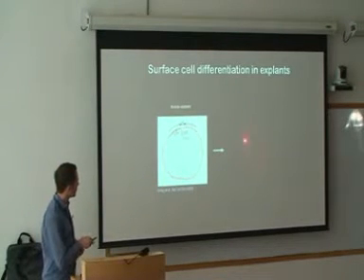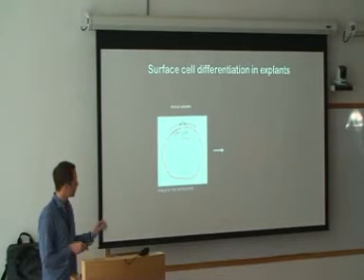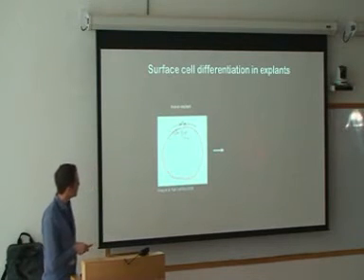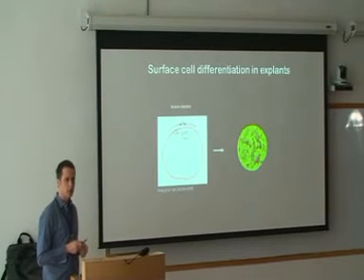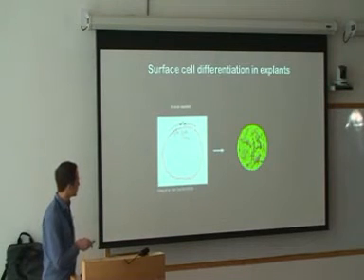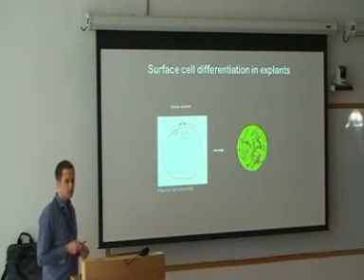What we observed was that once we took a tissue, in this case an ectoderm cluster of cells, from an embryo which is expressing GFP specifically in epithelial cells, and only in epithelial cells, we put it in, and we didn't expect very much to happen. But once we left that in culture, we noted, and again it's very hard to see for you, there is an epithelial shell surrounding the inner cells very shortly after you put these cells into culture. So all the surface cells are organizing an epithelial shell-like structure, and basically you end up with a heterotypic cluster of cells which have epithelial cells on the outside, and the inner cells are non-epithelial.